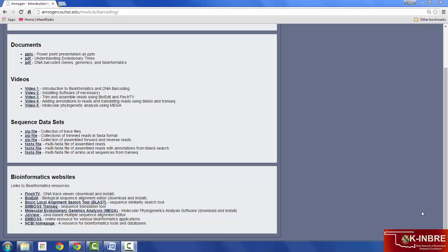The perfect program for this process is called BLAST, and one of the versions of BLAST that we'll be using is called BLAST-X. It's very popular. It's a pairwise local alignment search tool, and it will compare the amino acid sequence translations of a DNA query sequence to a protein sequence database. From this search, any significant matches found by BLAST-X will be retrieved and sorted in a list based on the significance of that alignment.